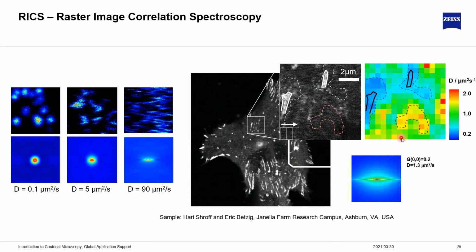So we can do a nice optical sectioning. We can do 3D imaging of very thick samples. We can separate many colors. We can get some nice numbers, so not only nice images, but you can also get very nice numbers. It's a very analytical tool.